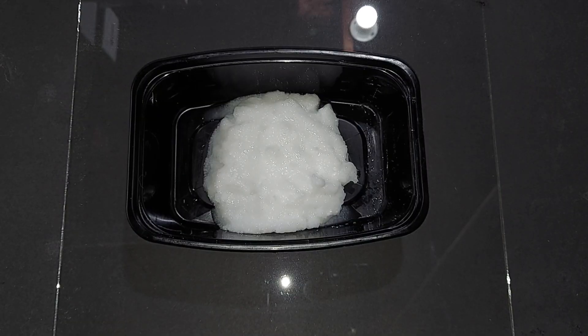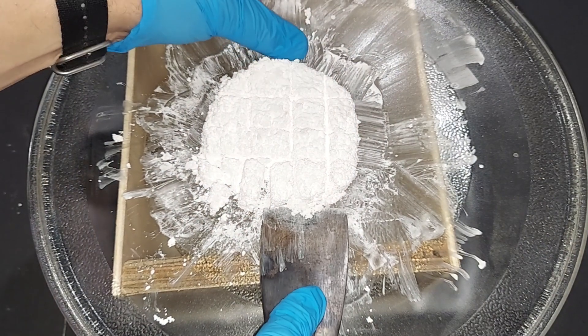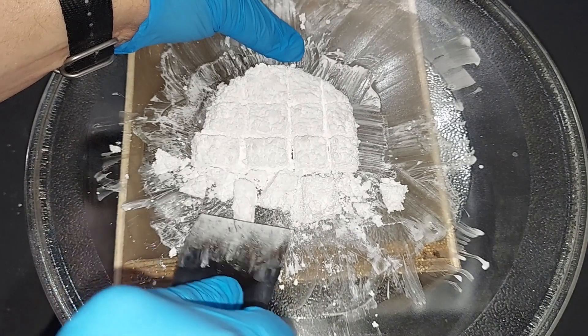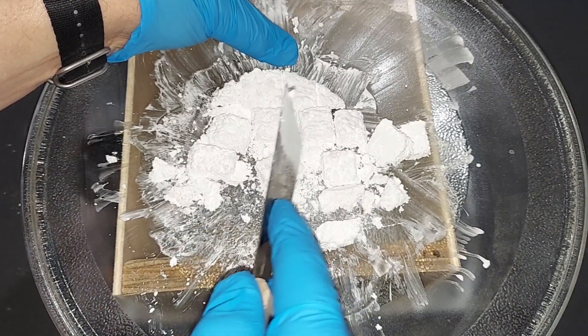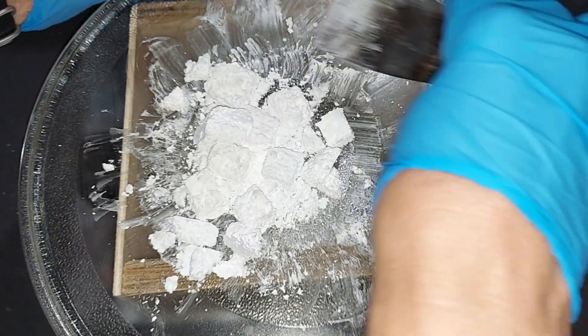After washing both piles with distilled water really well and letting them dry a bit, I combined them into a single plastic container. Since magnesium carbonate is hygroscopic, just letting it sit won't fully dry it. I also tried drying it on filter paper with heat, but the filter paper and magnesium carbonate became one — when completely dry, it got very fragile and impossible to separate. The only real solution is to put it in a glass container and heat it until dry. I'm using a glass dish from a microwave, which works really well.